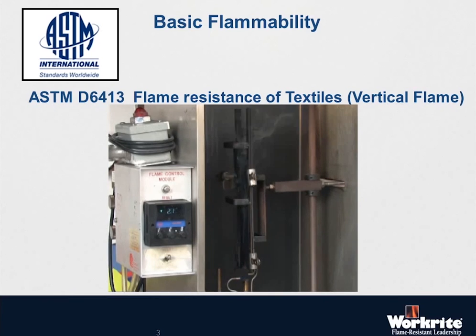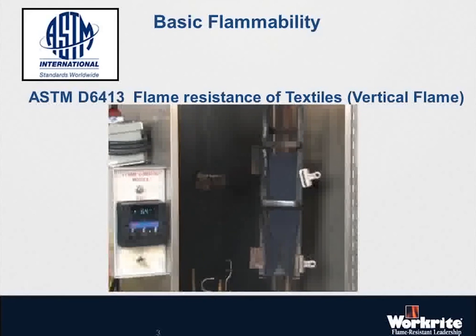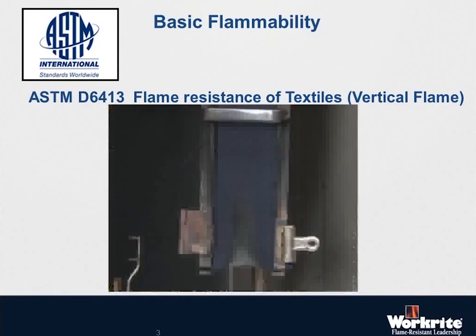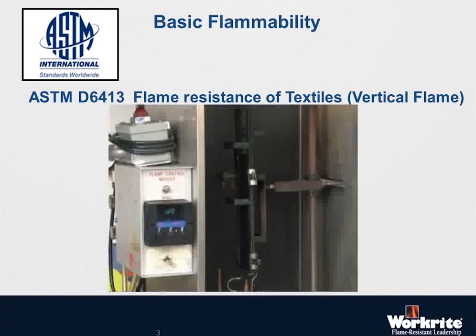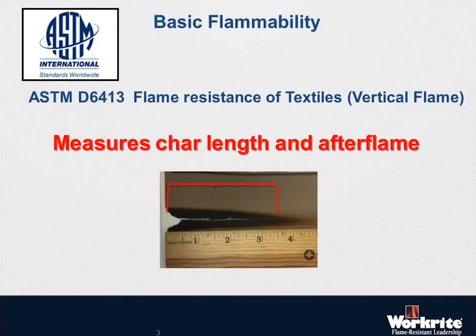And there's a couple things that are being measured when that flame extinguishes. One thing is you're looking for after flame. Was there any after flame of the fabric continuing to have some flaming going on after the burner's been turned off? And most of the standards require that a maximum of 2-second after flame be involved. If you look at the char length, what you're measuring then is the part of the fabric that has been charred and broken.